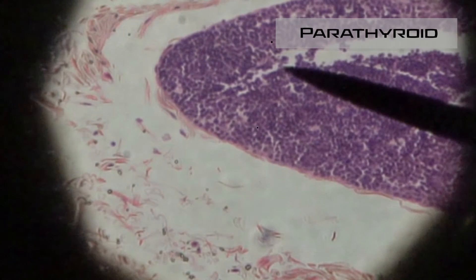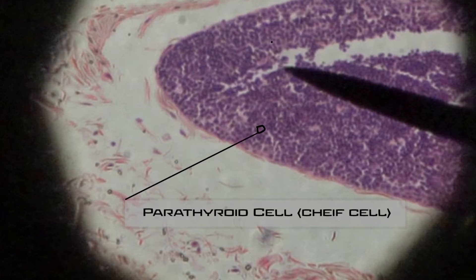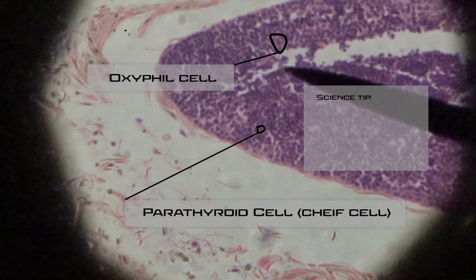Here at the parathyroid, you're going to see two types of cells. The first are the parathyroid cells, which are responsible for secreting parathyroid hormone, which increases calcium levels in your blood. You also see oxyphil cells here, though the function of those is still being debated.